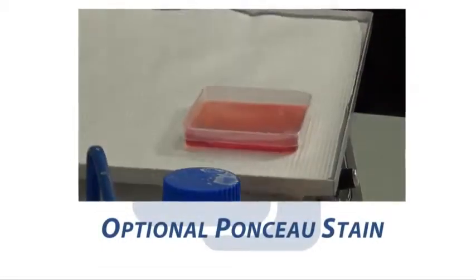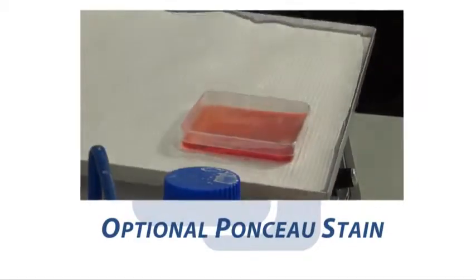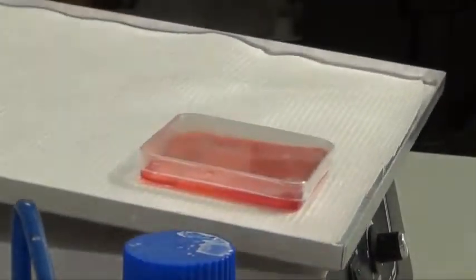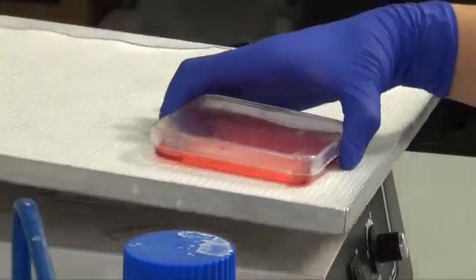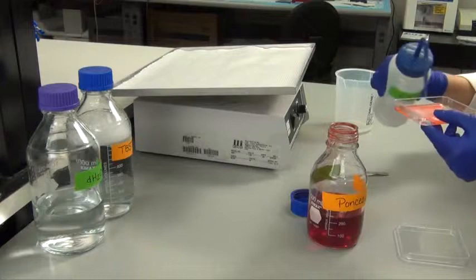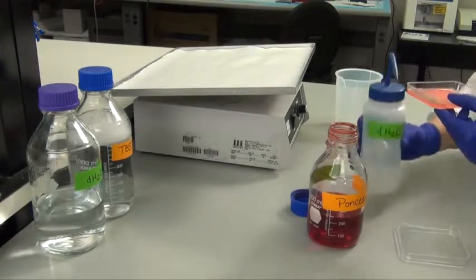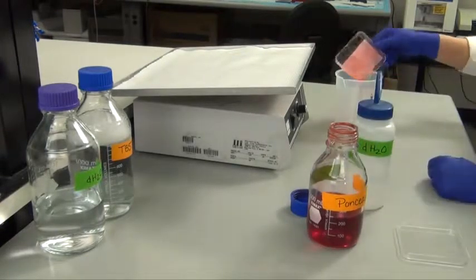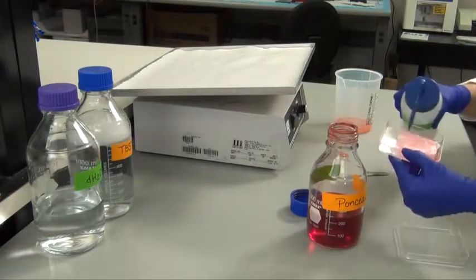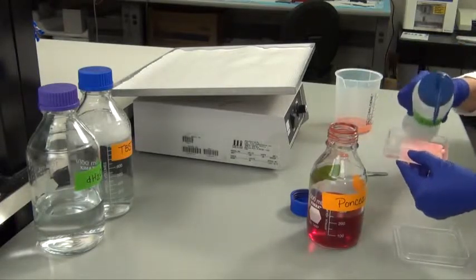As an optional step, we can verify the proteins were transferred successfully by staining the membrane with Ponceau red. Incubate the membrane in Ponceau for 5 minutes and wash with water until the bands are clear. After verification, the blot can then be destained by continuing to wash with water or TBS tween until the dye is completely removed.